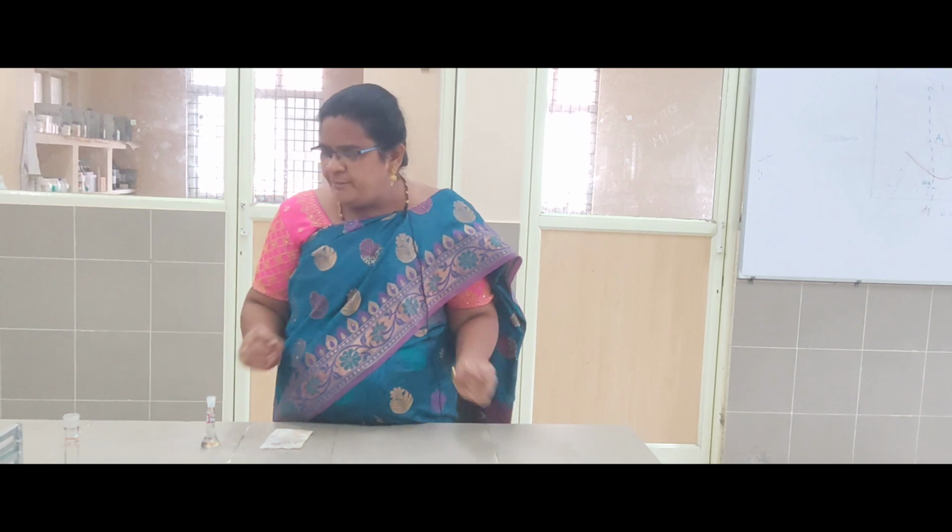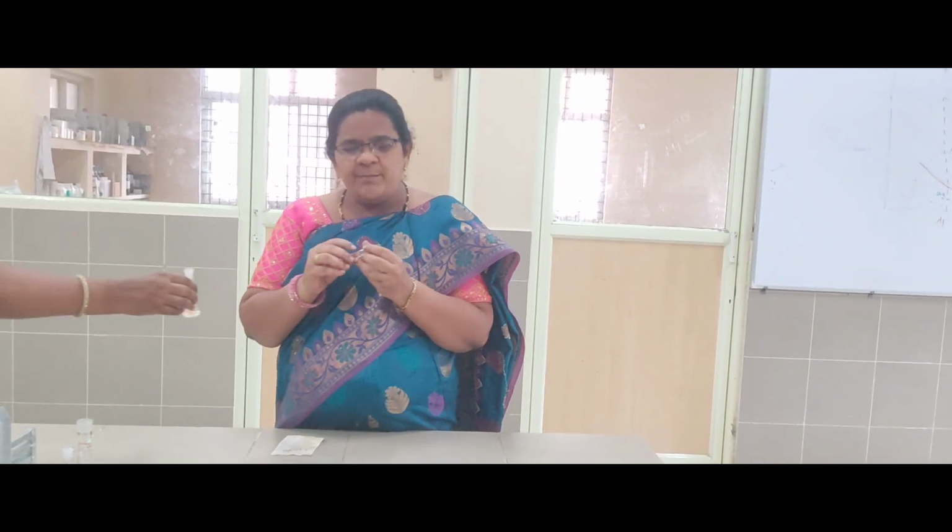Next, you have to prepare the test sample solution. This is the ampule. You have to break the ampule carefully and take 1 ml, which contains 25 mg of diclofenac as per the label.